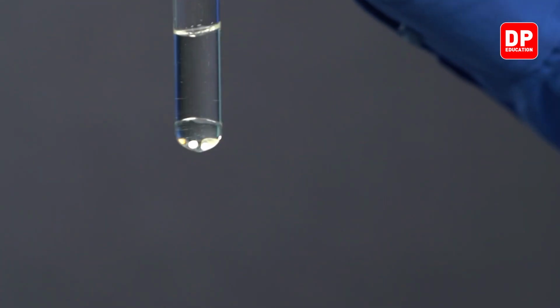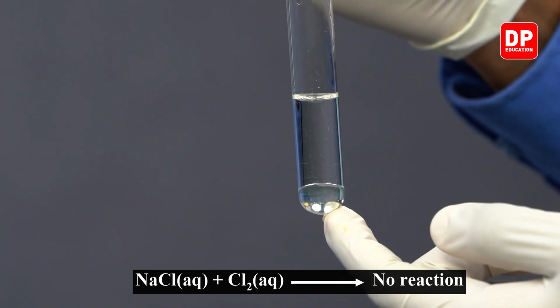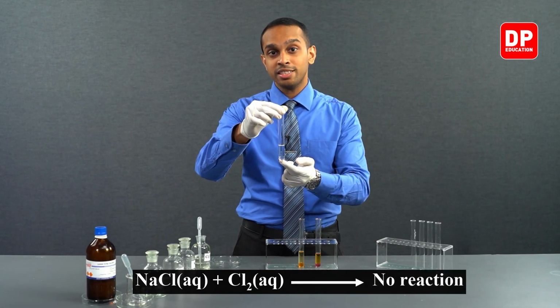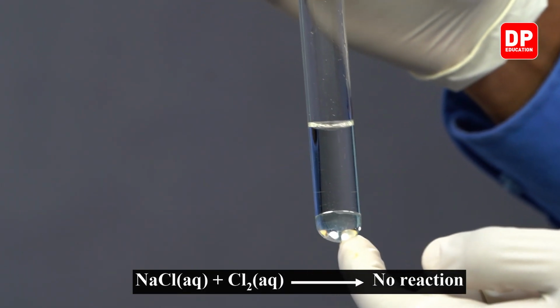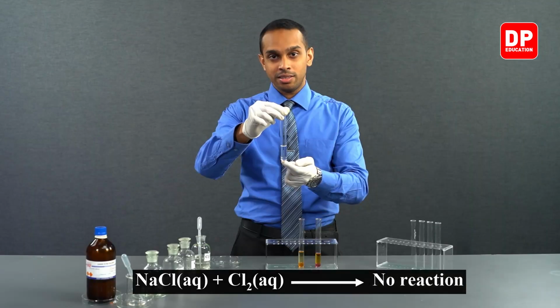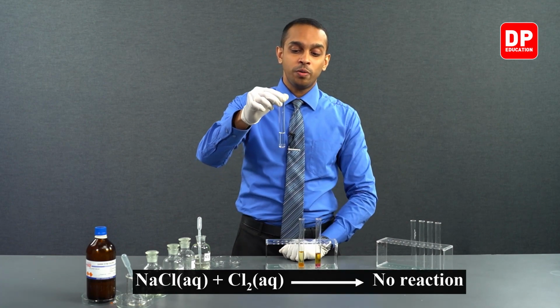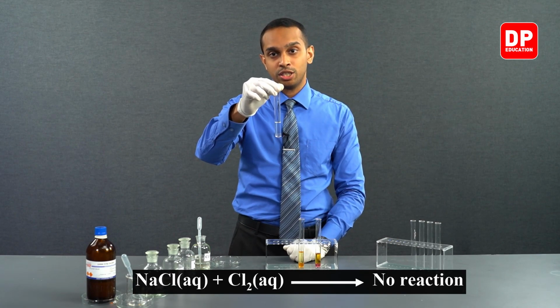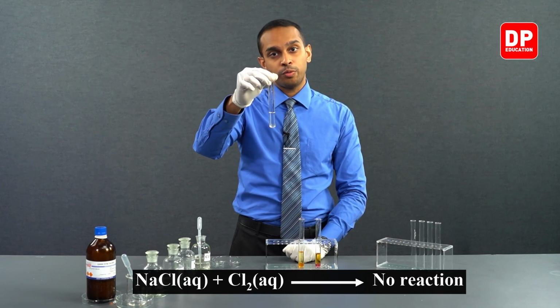Did you observe any changes? The answer to that would be no. The reason we will not see a change when we add chlorine water to a chloride ion solution is because chlorine, or Cl2, will not displace chloride ions because it's the ionic form of chlorine. So over here, you will not see any displacement or any color change happening just because we added a little bit of chlorine water.